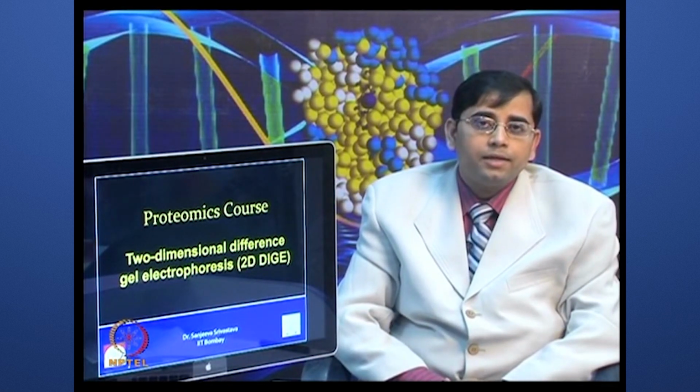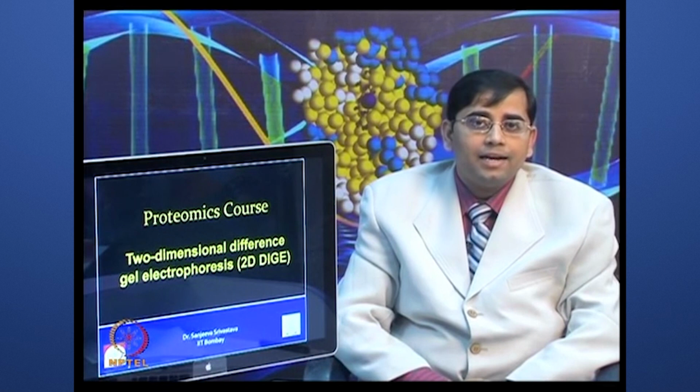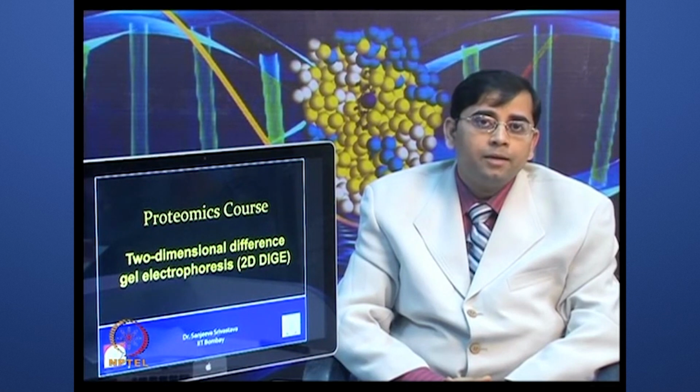Finally, we talked about different types of staining methods which are available and how to scan and analyze those images. We then further talked about different advanced methods which are creative ways of overcoming limitations of gel based approaches.